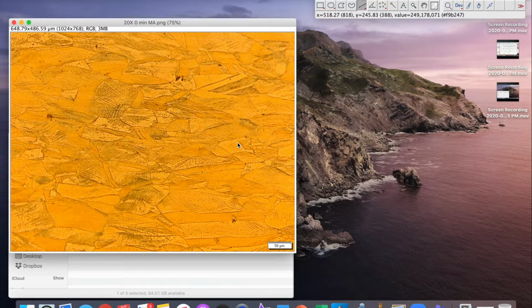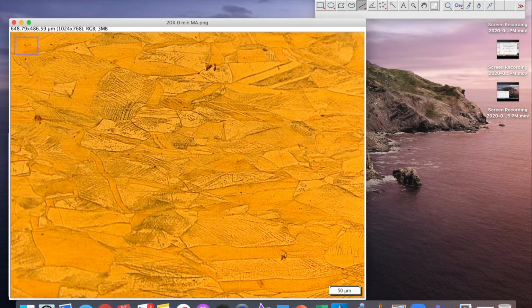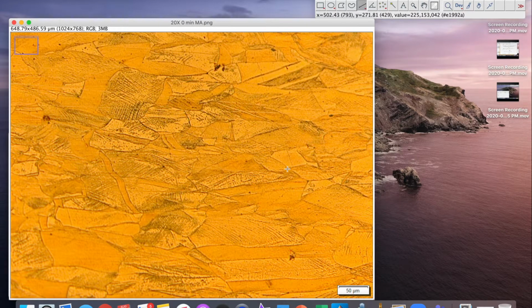All right, so now we want to start the analysis and start the calculations. So again, the two things I need to know are how many intercepts I have over a given length. So that's what we're going to do. But I also want us to think ahead, because we're going to look at this anisotropy index, which they say as AI. And this allows us to quantify the level of rolling, right? Because the more elongated we can see with the anisotropy index.